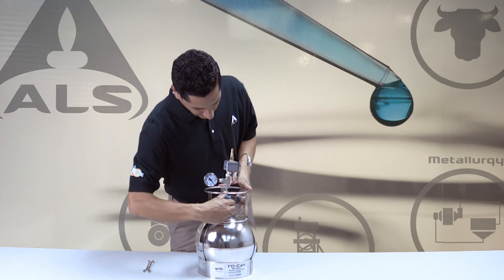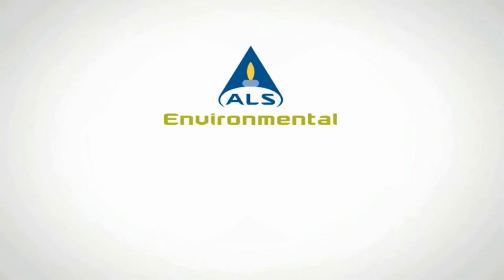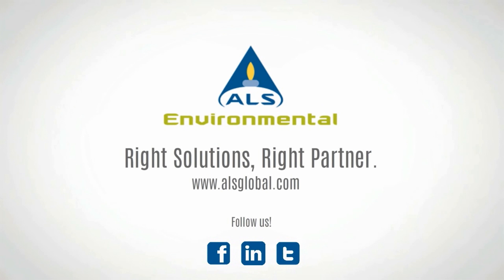If the canister retains pressure, it is considered to be leak-tight. For additional information, please visit www.alsglobal.com or contact your ALS project manager.